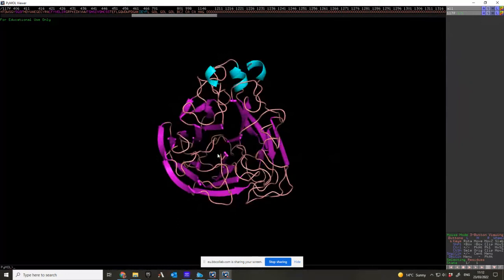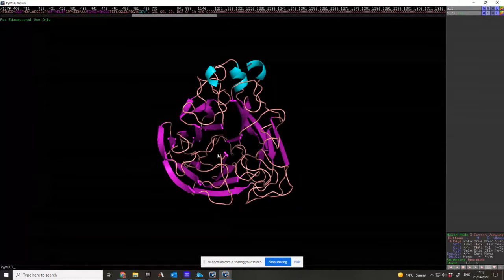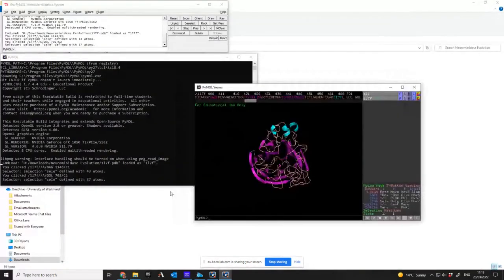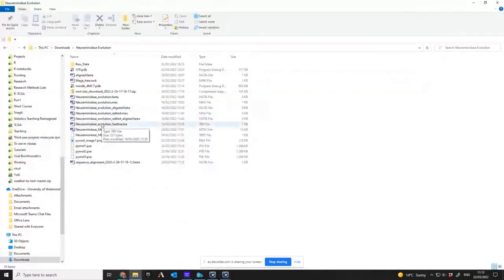So a couple of the projects ask you to identify what the important amino acids are. And a good thing that you could do, especially in the hemagglutinin case, where you're asked to actually demonstrate where they are in the structure, is to identify the important and unique amino acids and then add them to this drawing. So that's what I'm going to do now.